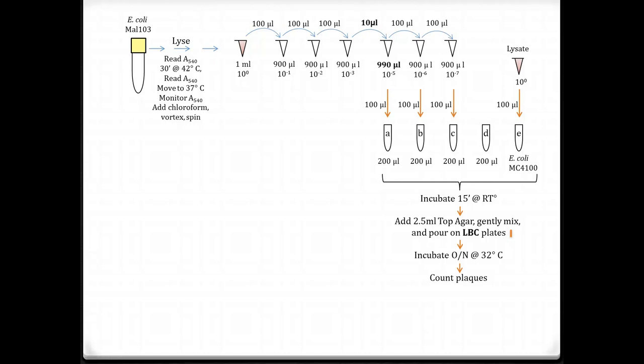So then you've got to continue with the experiment. You're going to use some of these other dilutions to actually carry out the experiment, and that is to investigate what happens when you create operon fusions, either in one particular part of the genome or throughout the genome. What we're going to do is take four tubes. You can label them anything you want, but I think 0, negative 1, negative 2, negative 3 are probably a good way to label them. Those are the concentrations that they're coming from up there, right? If you want to label them something else, that's fine too.